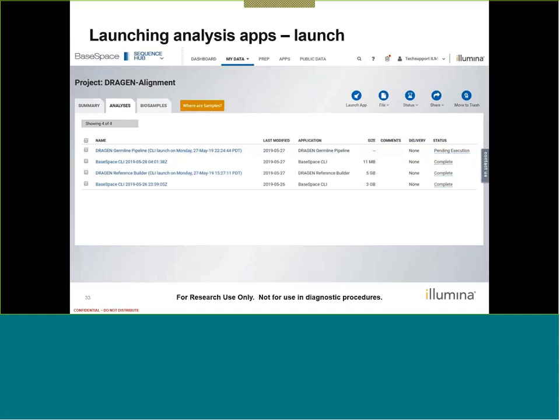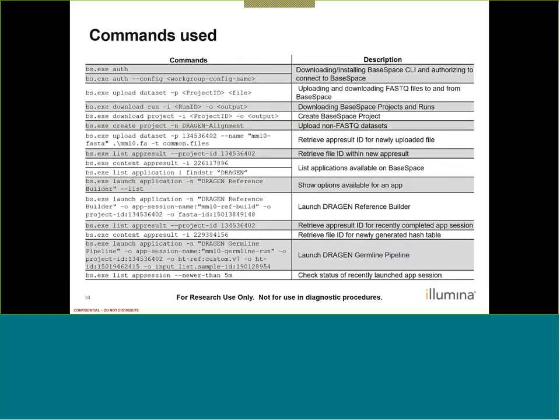And just for convenience, I've listed out all the commands we used throughout this presentation and a brief description of what they're doing, just as a kind of a nice little cheat sheet if anyone wants to try running these with any of their data.